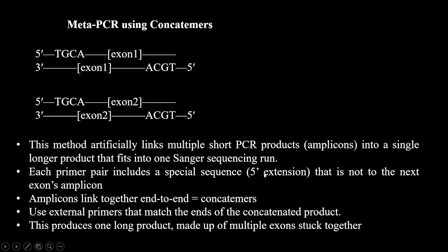Today we are going to discuss the techniques which are used to detect the mutation. But before we move forward, I want to discuss about the meta-PCR and why it is essential.